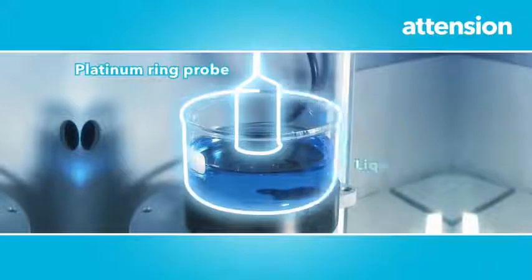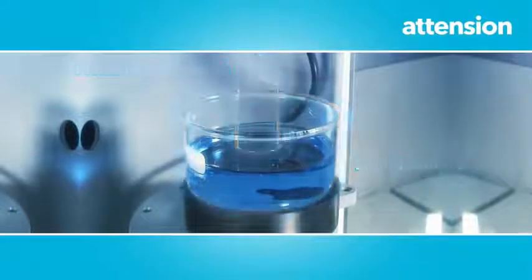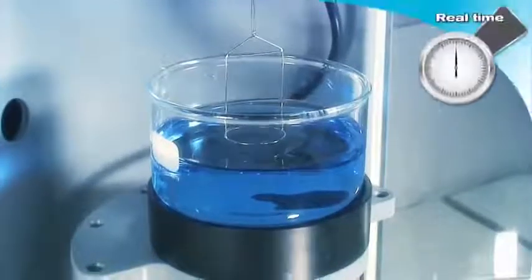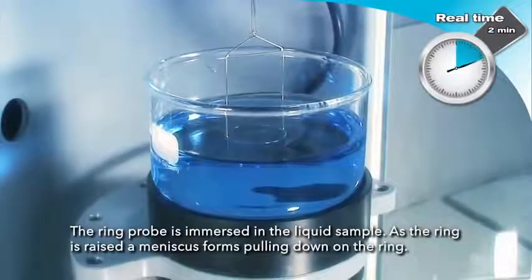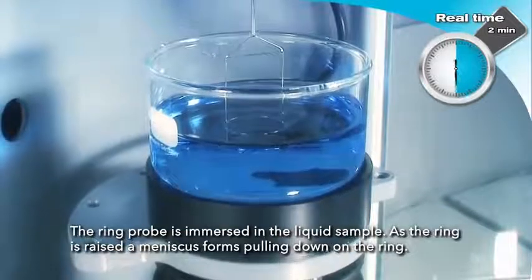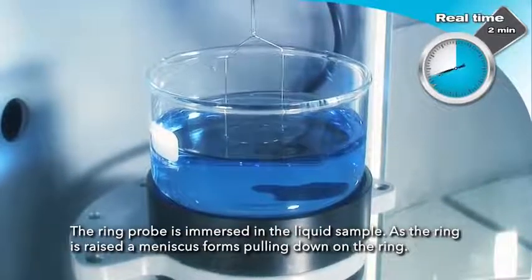A platinum ring probe hung on the balance is used to measure the surface tension of the blue liquid positioned on the sample stage. The ring probe is immersed in the liquid sample as the ring is raised and meniscus forms pulling down on the ring.